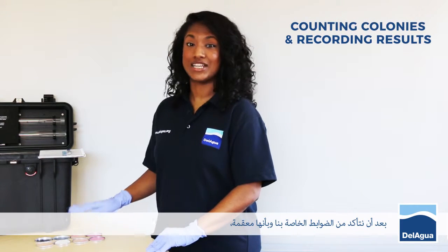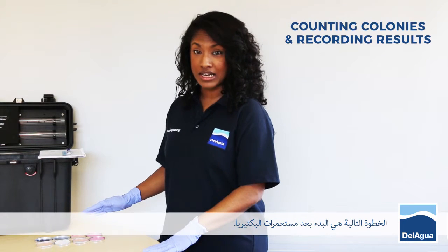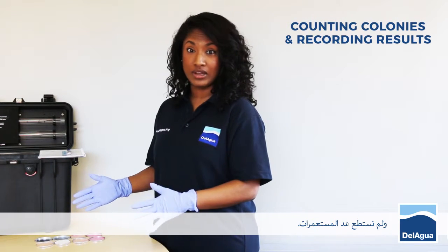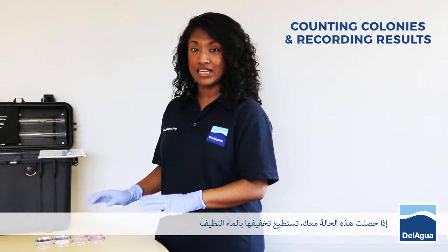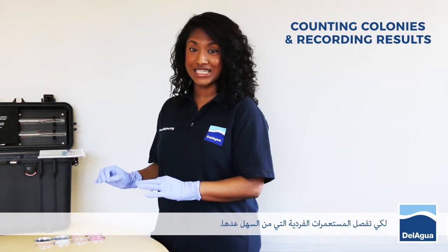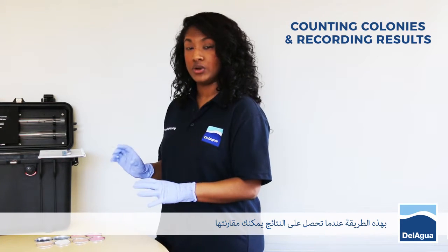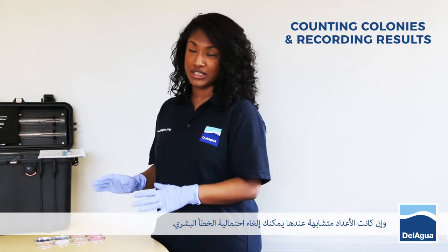Once the controls have been looked at and checked and you can verify that they've worked, the next thing to do is to start counting your colonies. From a previous run, we found that this particular sample was heavily contaminated and we were unable to count the colonies. If you find that this is the case with your samples, you can always dilute them with clean water in order to isolate individual colonies, which are much easier to count. It's also best practice to run all your samples in duplicate. This way, when the results come out, you can compare them and if they're very similar in counts, you can then eliminate the possibility of human error.